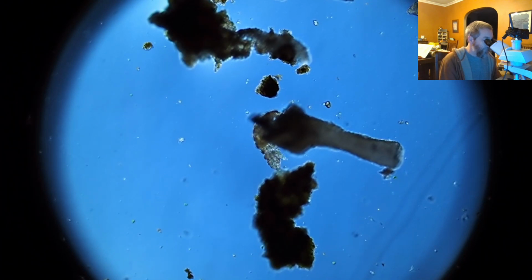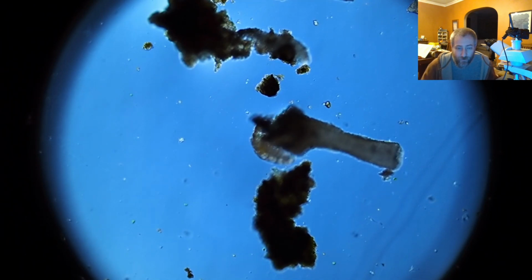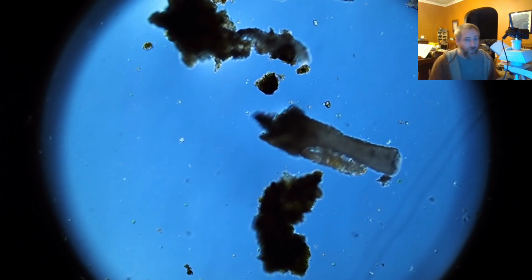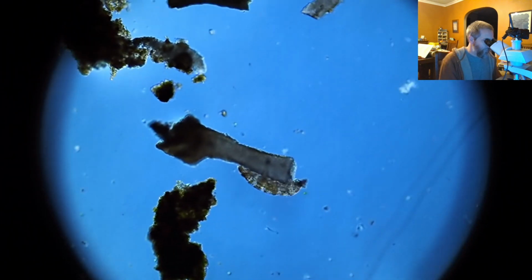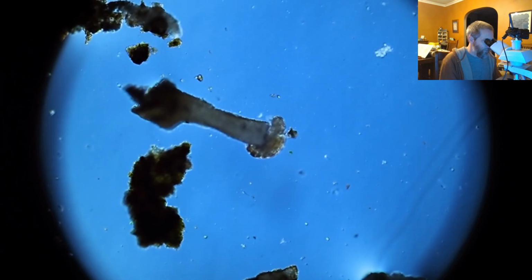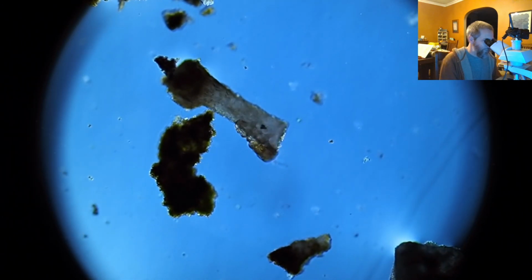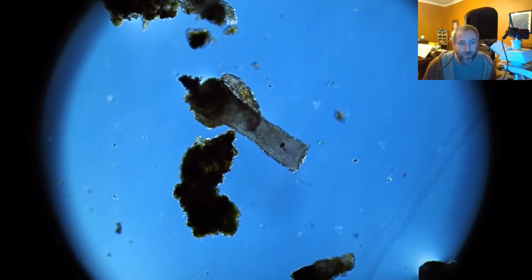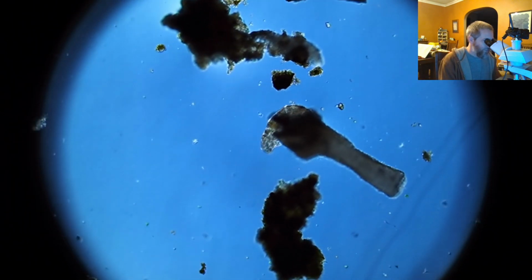So they have 8 feet, and on each one of the ends of each one of the feet, they have sets of claws that are sort of curl shaped, and they can use them to grasp stuff. And the ones in the back are only used for grasping. You can sort of see that it moves like a caterpillar, kind of, with the front 6 legs sort of clambering around, or I don't know, they look like a little baby that's been turned over, like having a hard time flipping itself back over. And then the back 2 feet sort of work together, and they just grab and clasp stuff and allow them to kind of use the front arms to move themselves around. So, but they actually have claws on the ends of their feet. So each one of their individual feet have sets of claws on them, and if they weren't kicking around quite so much, you probably would be able to see them pretty easily.